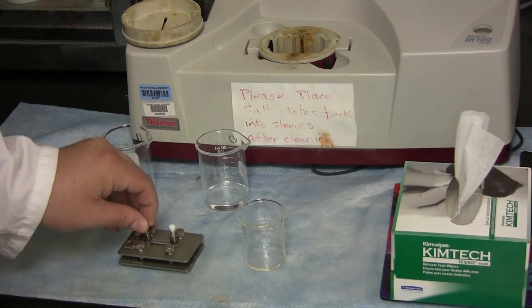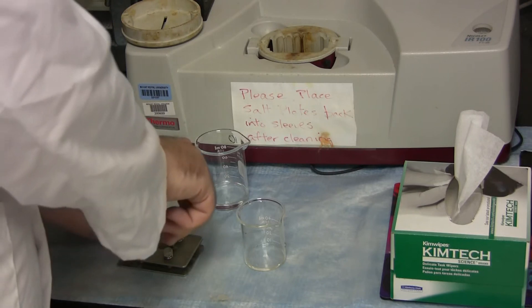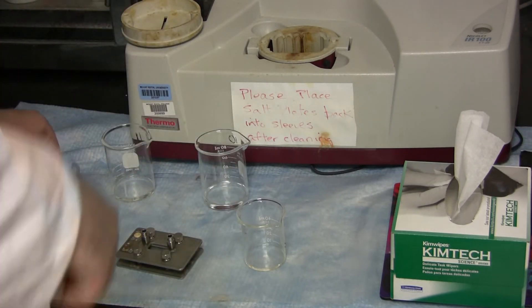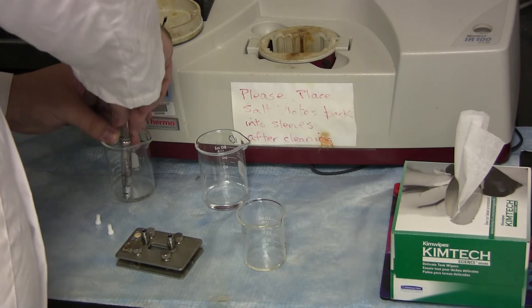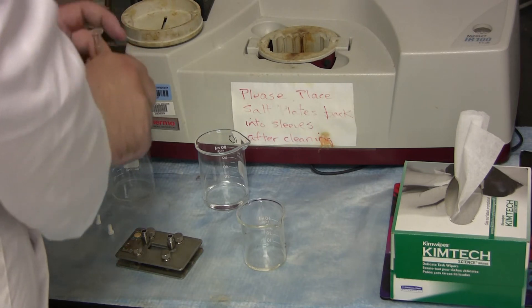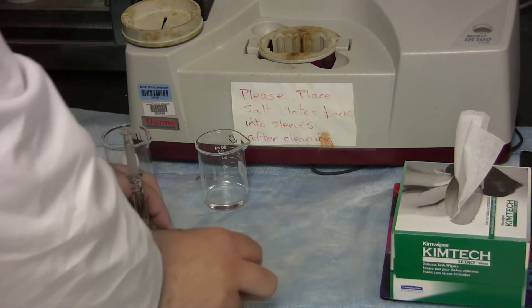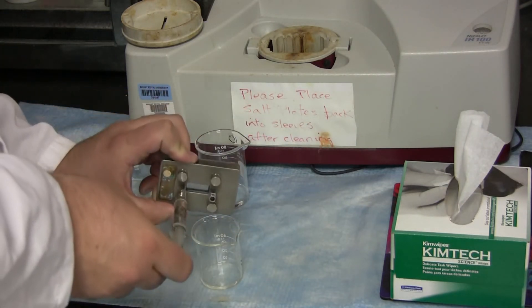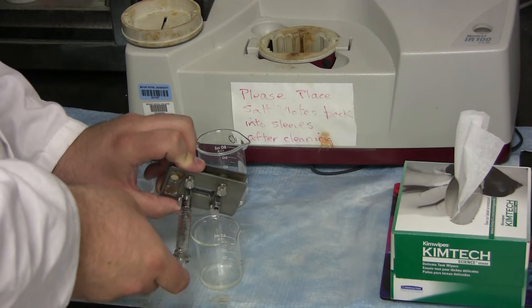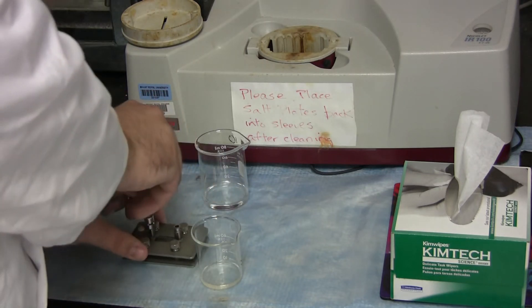Start off by removing the plugs from the solution cell. Now take the syringe and withdraw some of your solvent into it, and screw this onto the solution cell. Place the open end of the solution cell over the waste beaker, and then push down on the syringe to clean the cell. Once fully drained, unscrew the syringe.